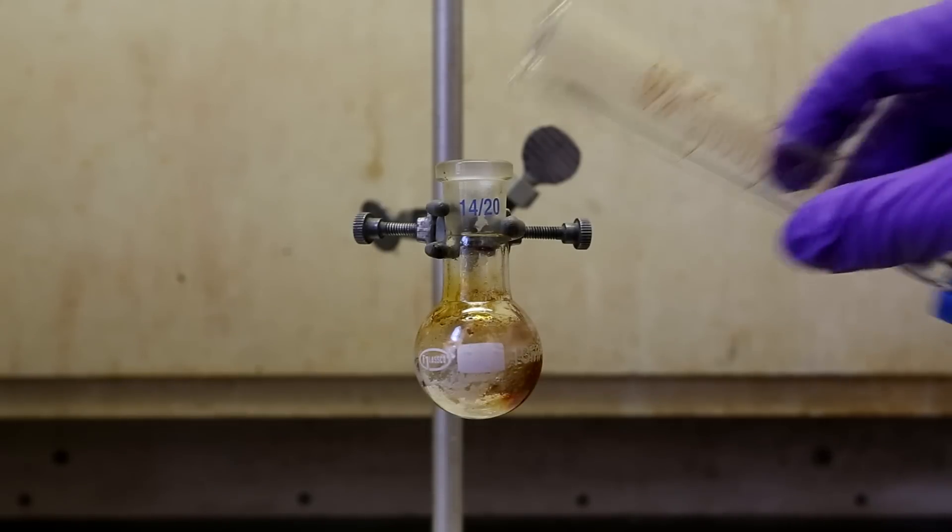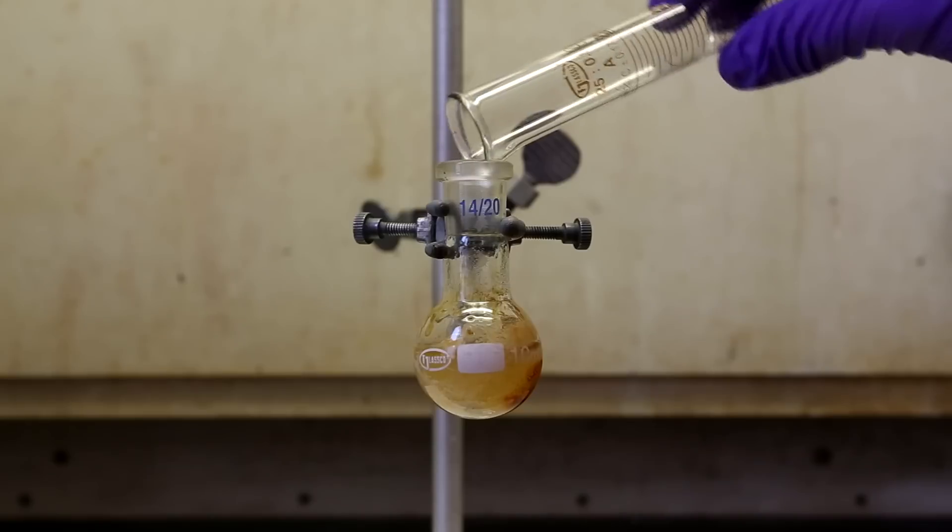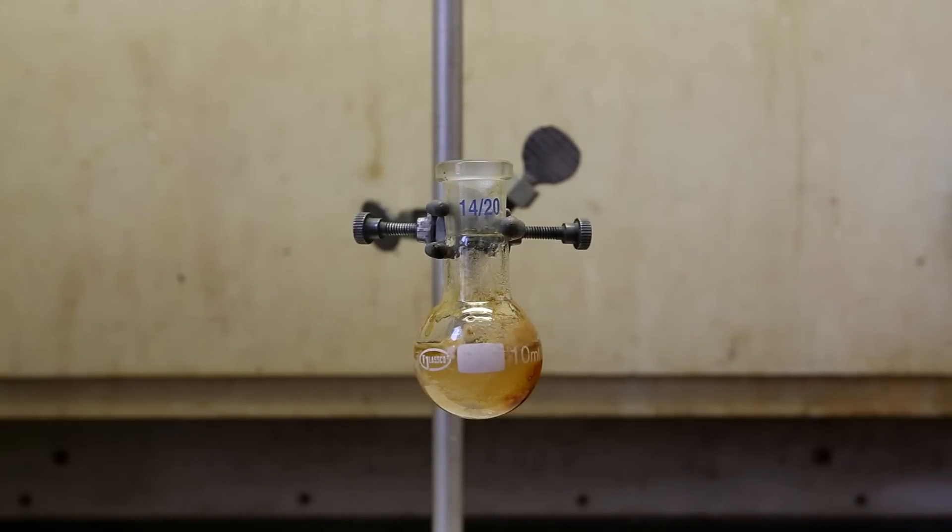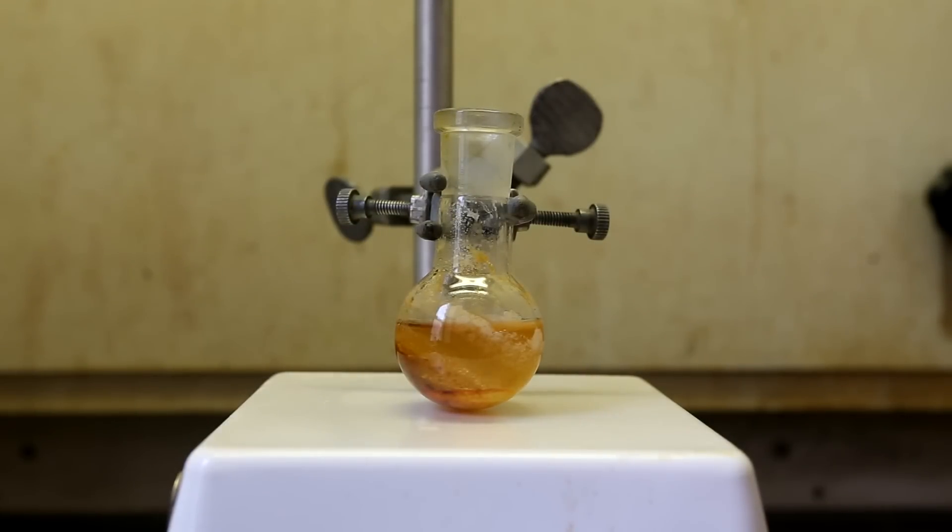After letting the flask cool for a bit, I added 10 milliliters of anhydrous ethanol. 10 milliliters was likely overkill and you could probably get away with much less, around 3 milliliters or something. I added a mini stir bar and I let the ethanol stir for about 20 minutes.